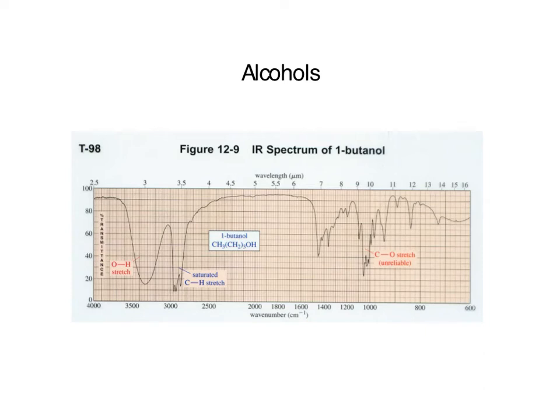We'll continue our discussion of infrared spectroscopy, looking at some different functional groups, moving out from the alkyls, alkenes and alkynes that we've seen before, because that's where IR really becomes useful. Most organic molecules have CH2s. Many have CHs that come off of double bonds or triple bonds. So when we start utilizing IR, we really need to utilize it to find the different types of functional groups.